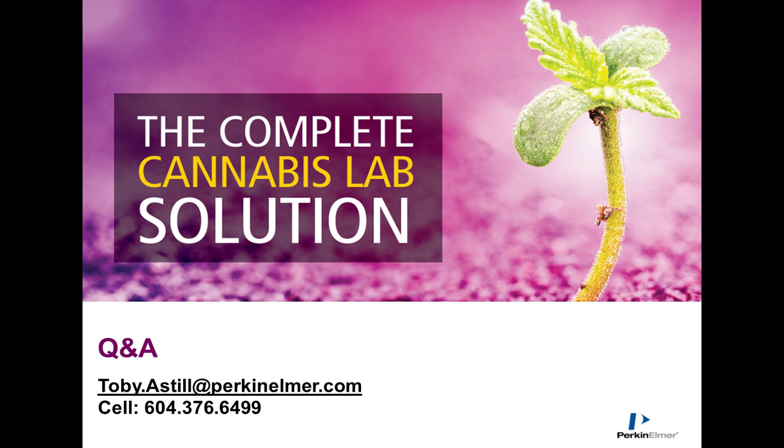The first question is, can you use the PerkinElmer Headspace auto sampler on a non-PerkinElmer GC? That's a great question, and the short answer is yes. We recognize that a number of laboratories already have GC or GC-MSs in their facility, but adding the terpene and residual solvent method does require a Headspace auto sampler. So we do have options to configure the PerkinElmer Headspace to a non-PerkinElmer GC.